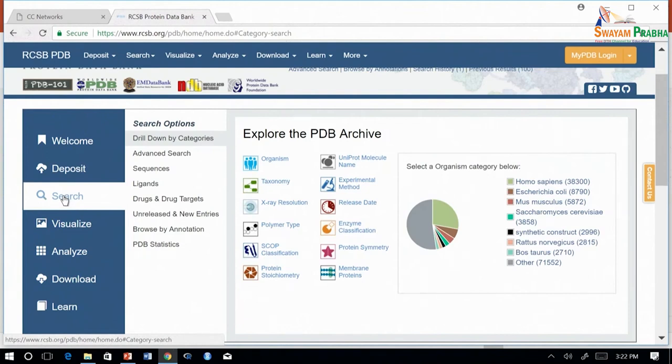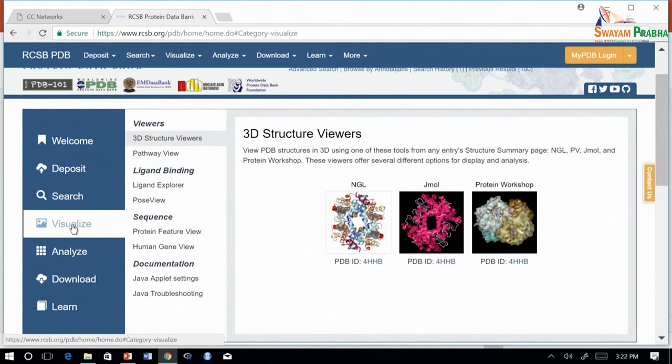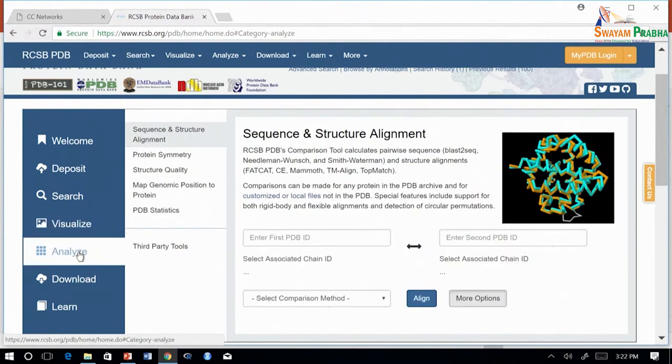The search tab is for users to search for a given crystal structure. The visualize tab gives software to view the 3D structures, sequence features, or interactions with ligands. The analyze tab gives in-house sequence and structure alignment tools, links to the PDB statistics page, as well as external tools.